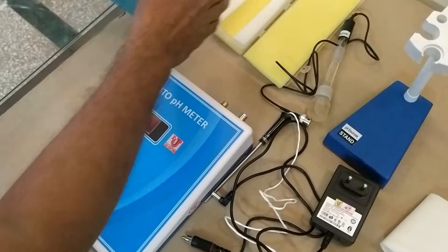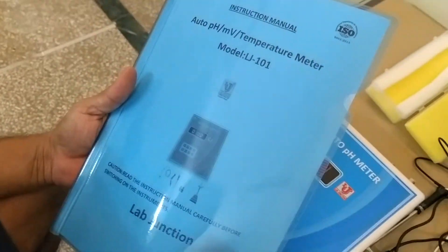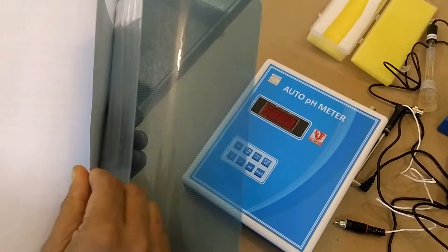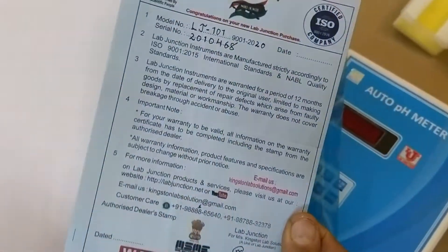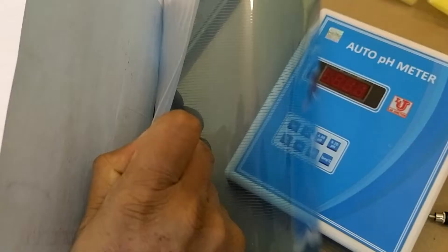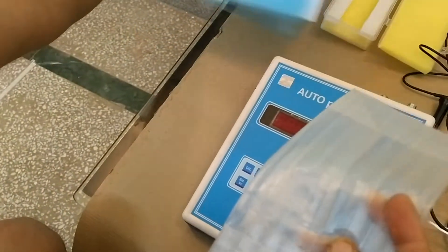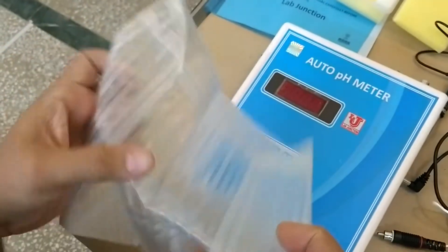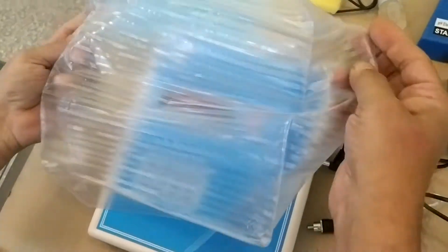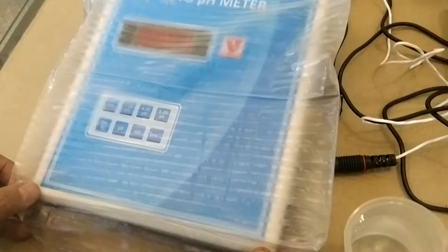This one is the operation manual for the auto pH meter. This one is the warranty card for one year warranty. And this one is the dust cover — you can put this cover on when you don't work on the pH meter.